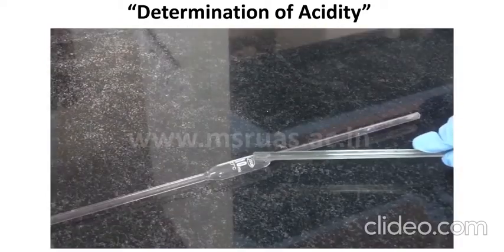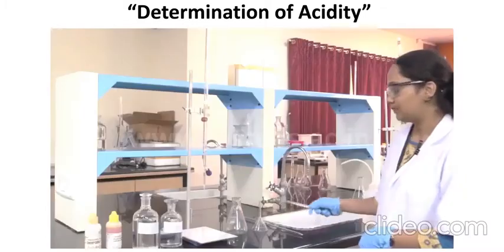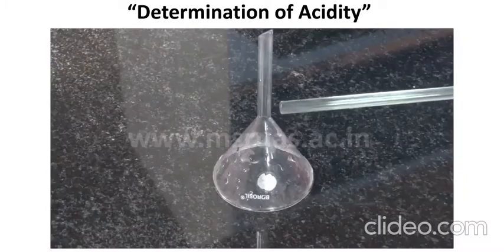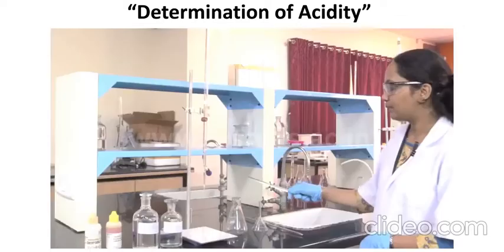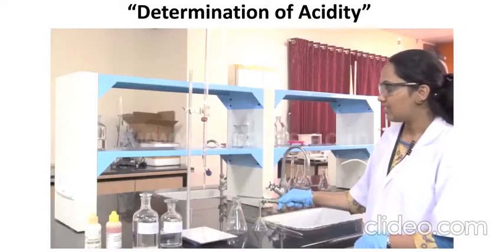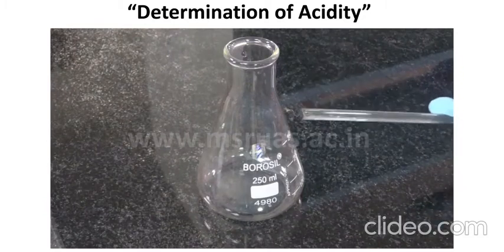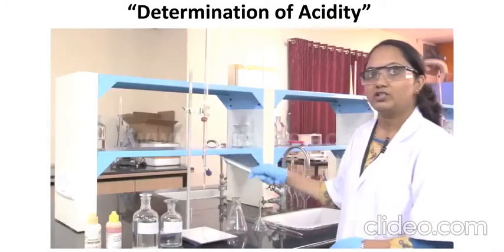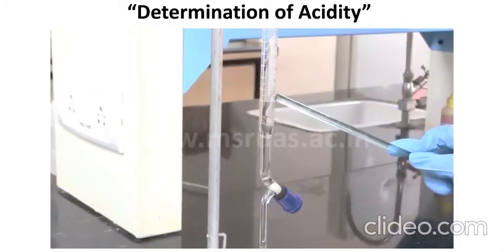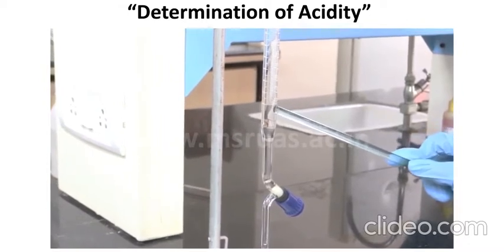Pipette, that is 10 ml pipette to withdraw 10 ml sample of water. Funnel, which is required to transfer the sodium hydroxide into the buret. Conical flask, 250 ml conical flask, which is used to collect the water sample for the test. Buret, that is 50 ml buret, which is used to hold the sodium hydroxide for the test.